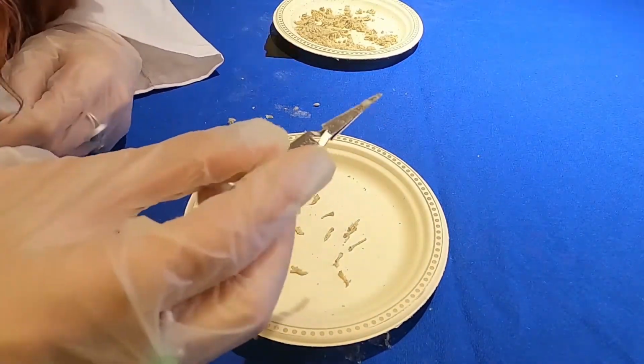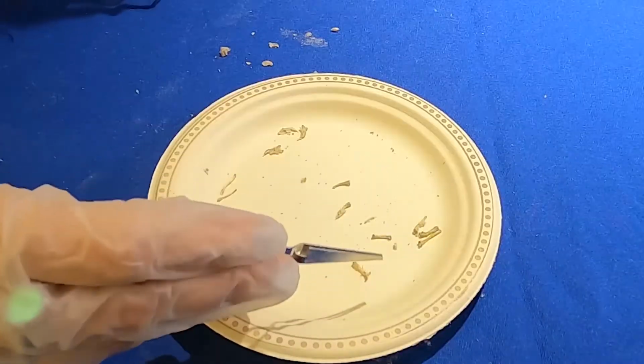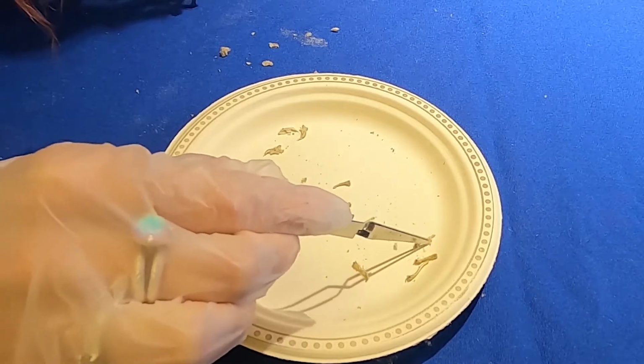Now what I like to do usually is separate everything out. Obviously you're not going to know just by looking at them what they are. So looking here, we definitely have some arm and leg bones. Those are going to be those longer ones.